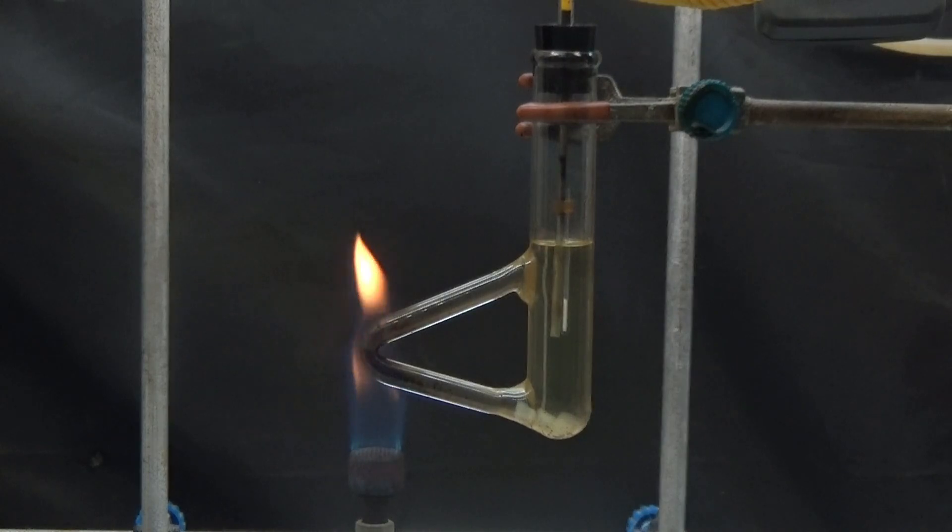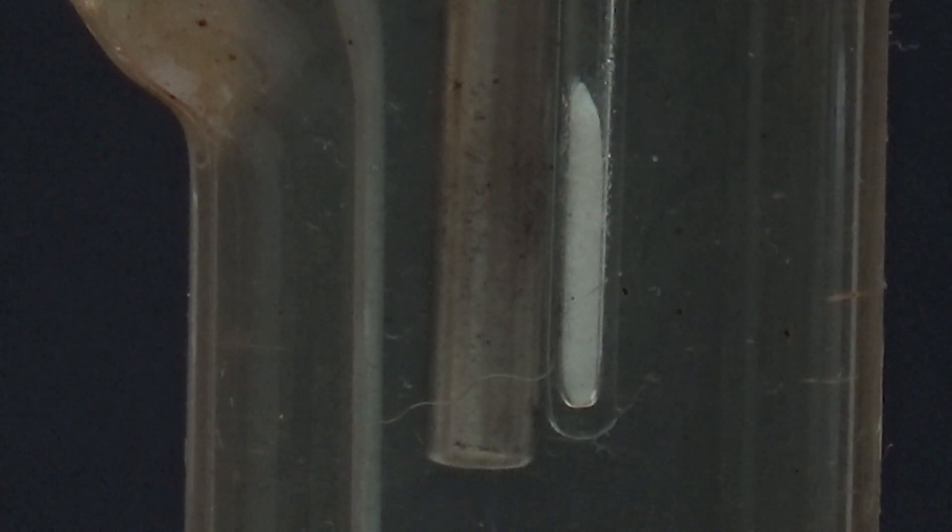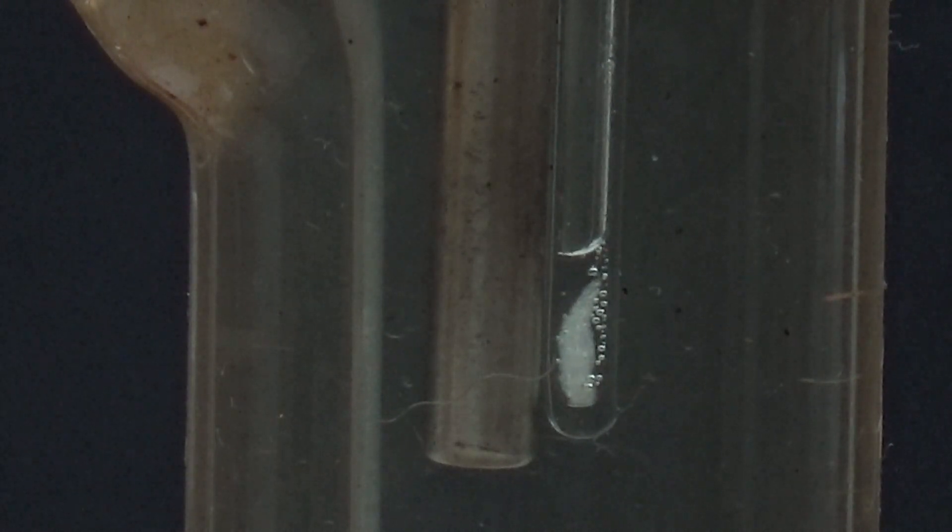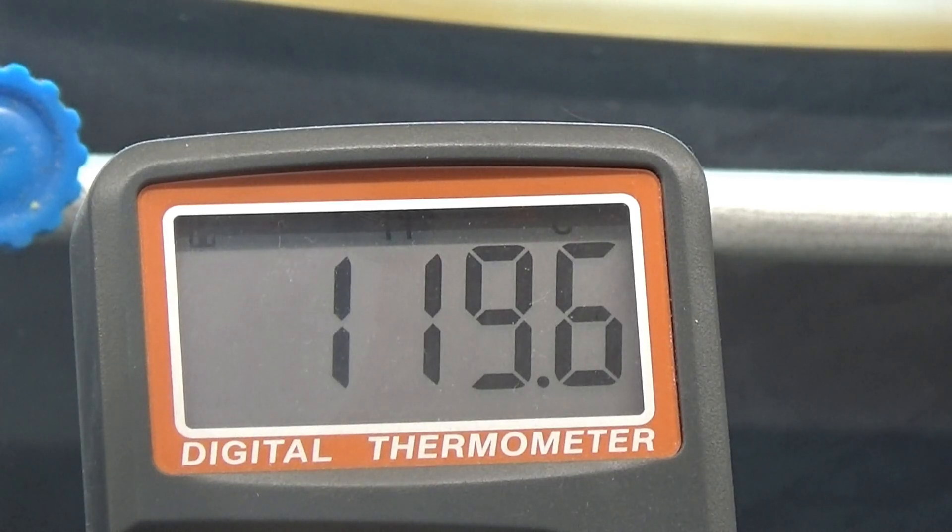The solid dries quickly and the melting point can be determined immediately because the last wash involved ether. There were no unmelted succinic acid crystals observed due to the fast melting point. The value obtained was 119.6 degrees, which is very close to the melting point of pure succinic anhydride.